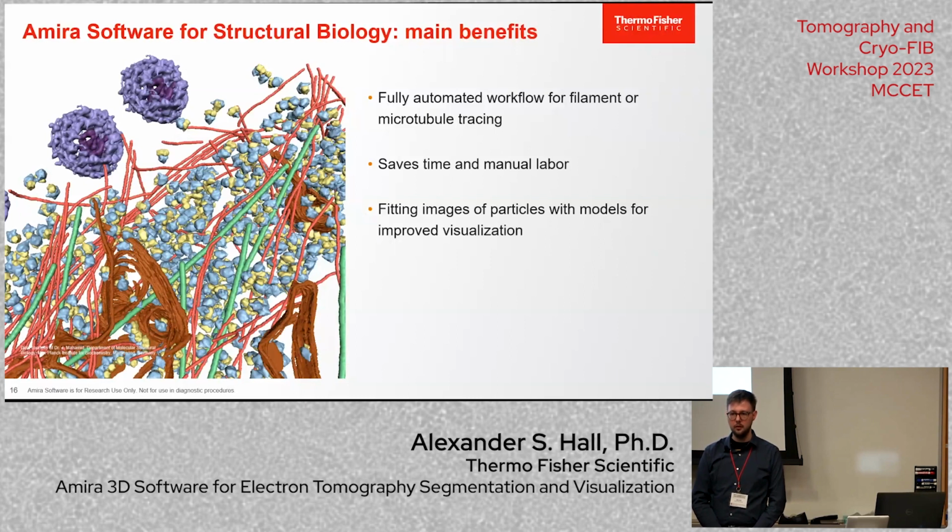So I wouldn't approach it as let's segment the entire image. That's a lot of work, and you may not really benefit from that in terms of your project goal, unless your point is to create a beautiful, fully segmented data set. We do those here and there, but in practice, you're usually segmenting one or two features, and that's it, to answer a spacing question, or how much is there a hole in this membrane, something like that.